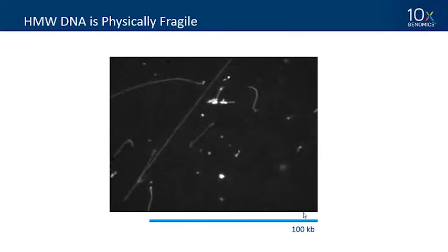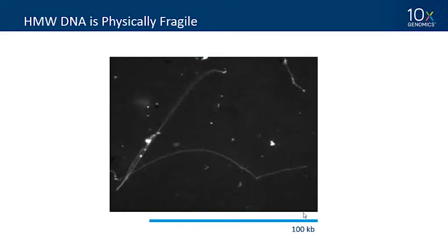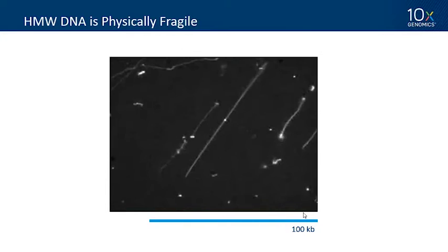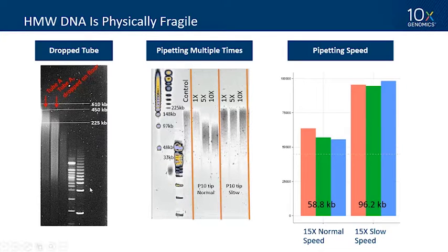For general tips on working with high molecular weight DNA, I always start by showing a video of single DNA molecules loosely tethered to a piece of glass — you can see how when they're elongated they're subjected to breaking during fluid shear forces. High molecular weight DNA is a physically fragile molecule, and we've tested this systematically. If you drop an Eppendorf tube containing high molecular weight DNA, you can break it. The band on the left shows the starting tube; after dropping it on the floor, DNA goes from above 225 kb to below 225 kb — you have to be very careful.